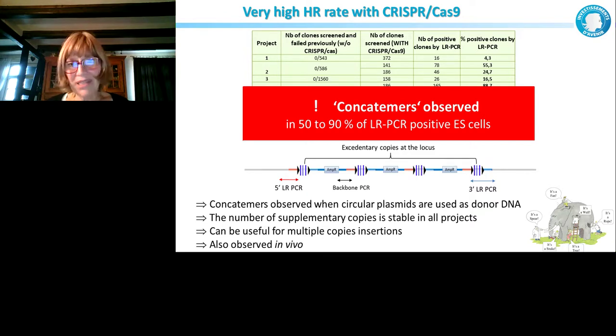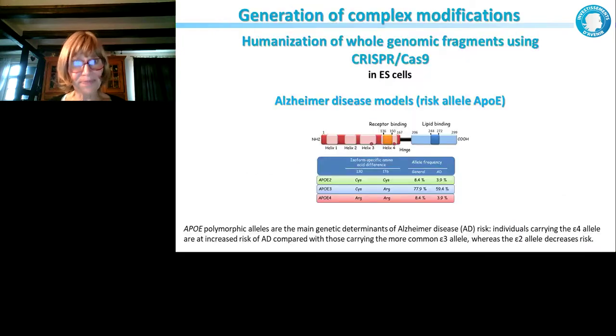And that's, again, what I want to say. I, again, show my little elephant with the blind men. You really need to check what you obtain when you use CRISPR. Be aware that you can sometimes observe some strange things, and check that everything is fine.